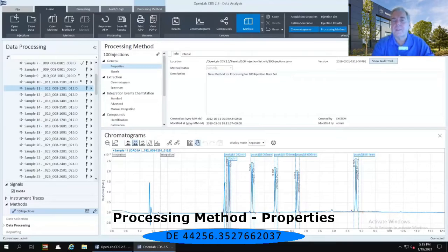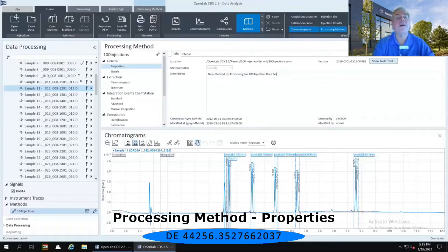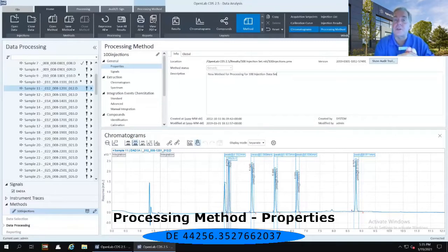So that's why we're concentrating today specifically on that data analysis portion because we have already acquired this data in the acquisition portion of the software.